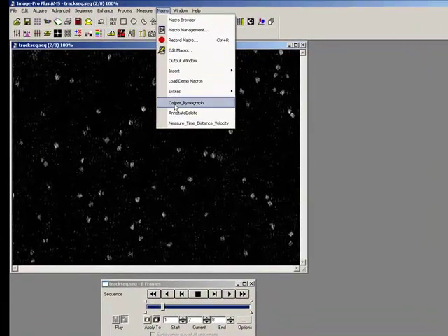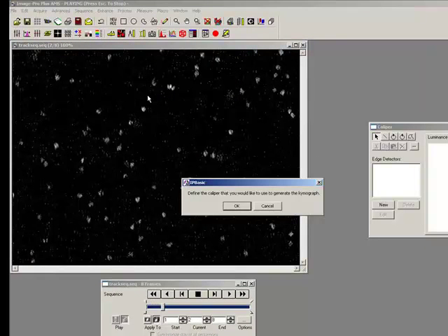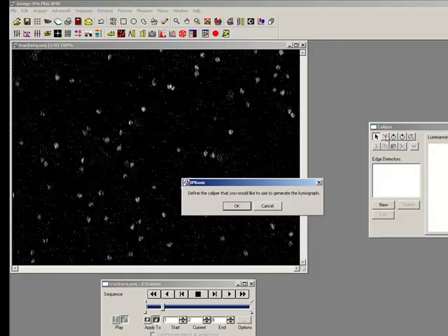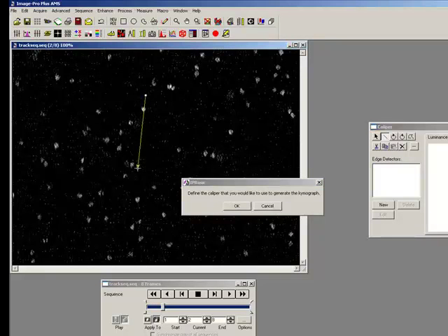to Macro, select the Kymograph Macro, and it says define a caliper that you would like to generate a kymograph from. So I'm just going to draw a line straight down there.